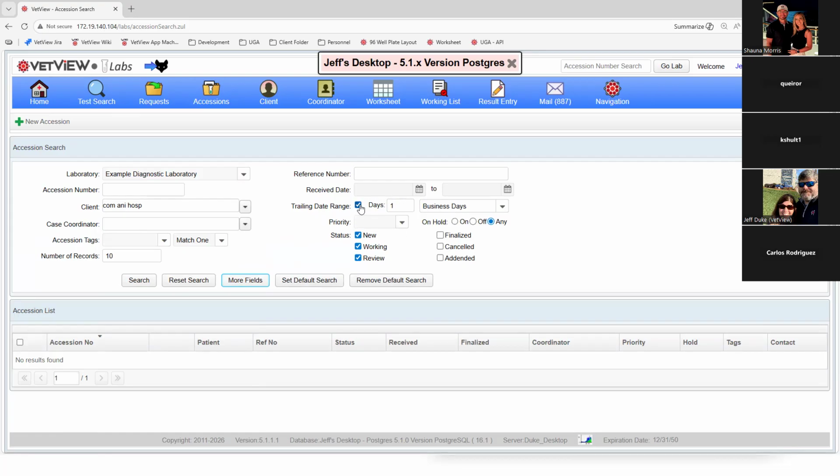So you want to see everything from the last, that's why I have mine set here to the last day. And you can say, and you do business day. So if you're trying to find things that are current, but you don't want to go backwards, there's different things that you can set. And this is also where you can set if you're using multiple labs, things like that.